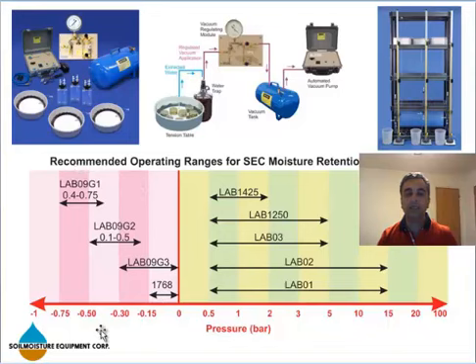As I said, close to saturation from 0 to 3/4 of a bar. You want to use a vacuum method from 0 to 0.15. You can use a hanging water column that you can see here, and I explained it earlier in this presentation. Then you can use some system like this one. The source of vacuum is a vacuum pump and a regulator, and Lab 9 and something like this.